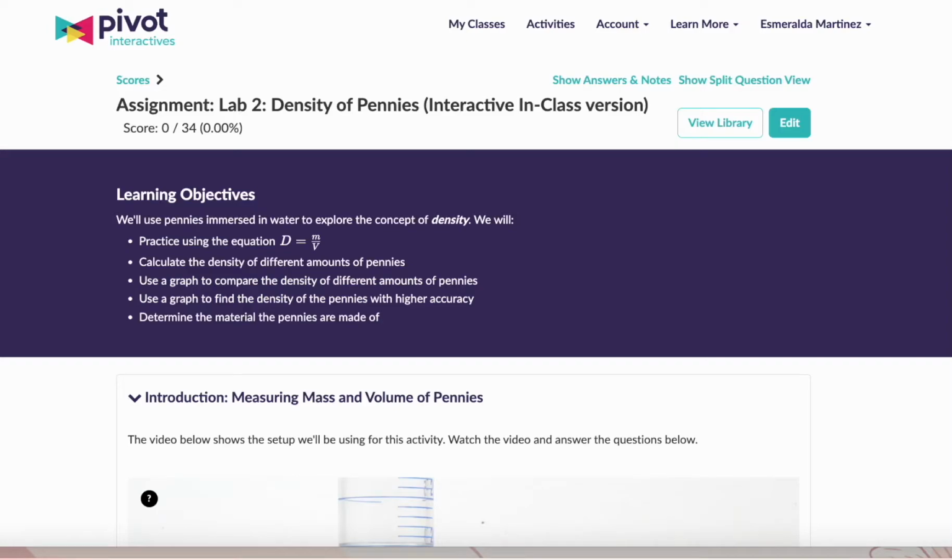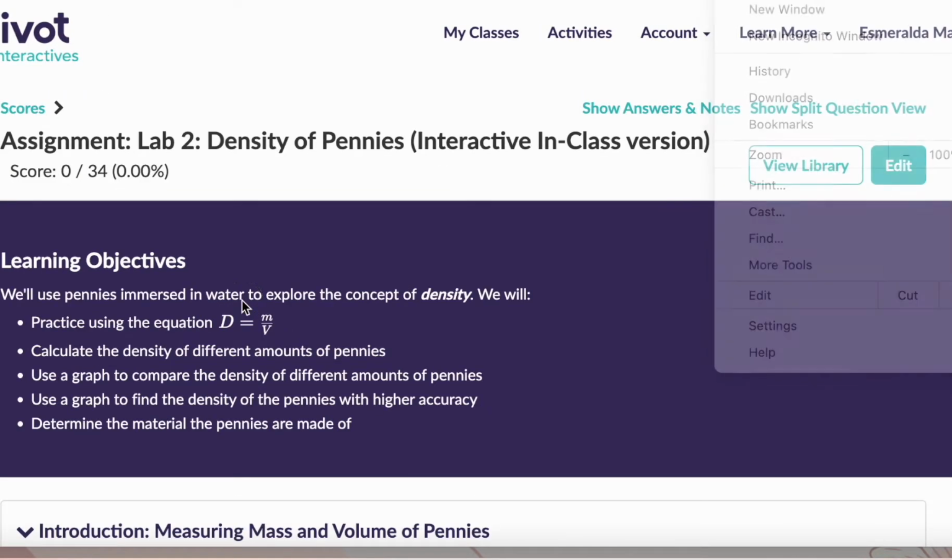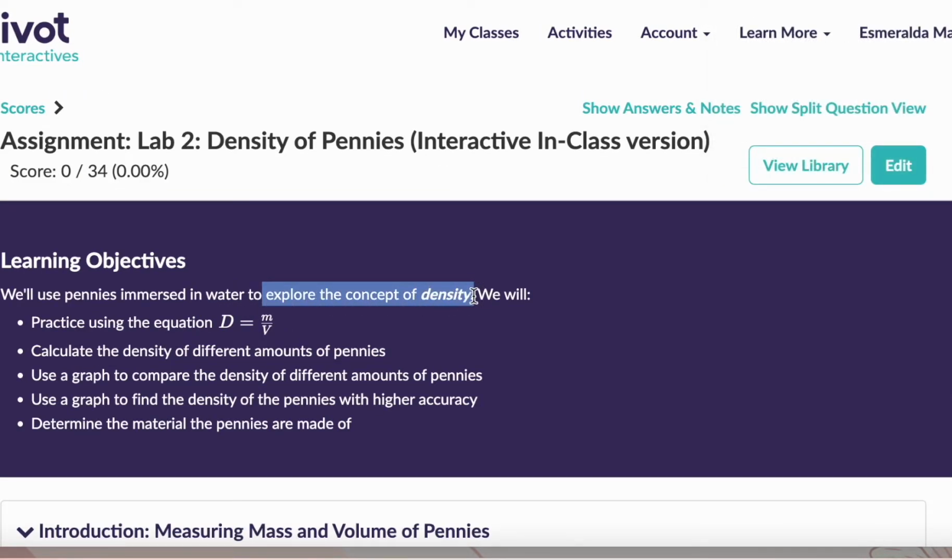Hi everyone. So in this video we will be discussing your lab 2, which is covering the topic of density once again. And specifically this week you're using pennies immersed in water to explore the concept of density.